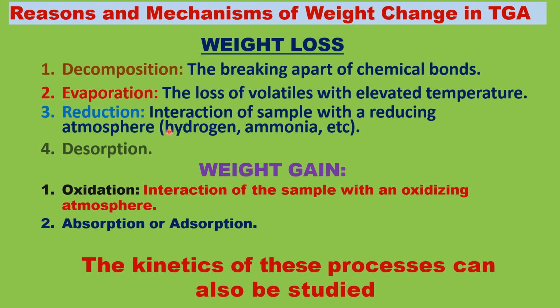The second case is weight gain. The substance will gain weight when there is oxidation, interaction of the sample with an oxidizing atmosphere, formation of an oxide layer, or absorption or adsorption, which results in weight gain in thermogravimetry.